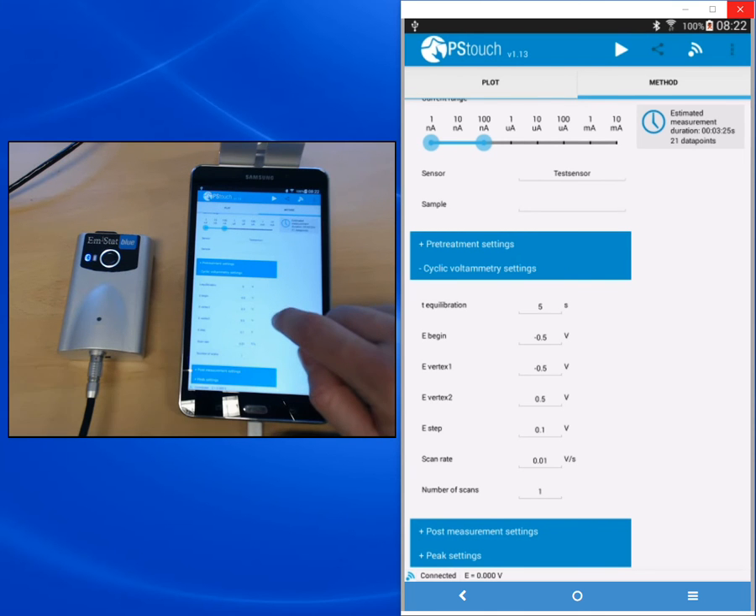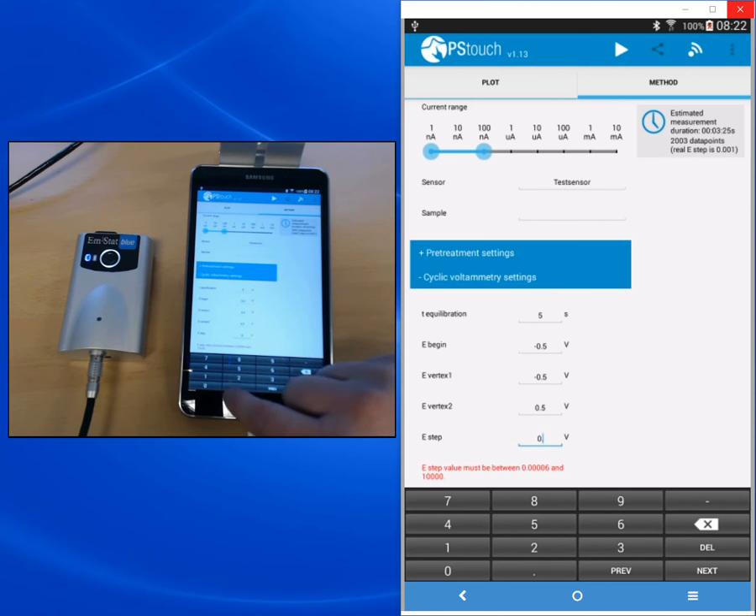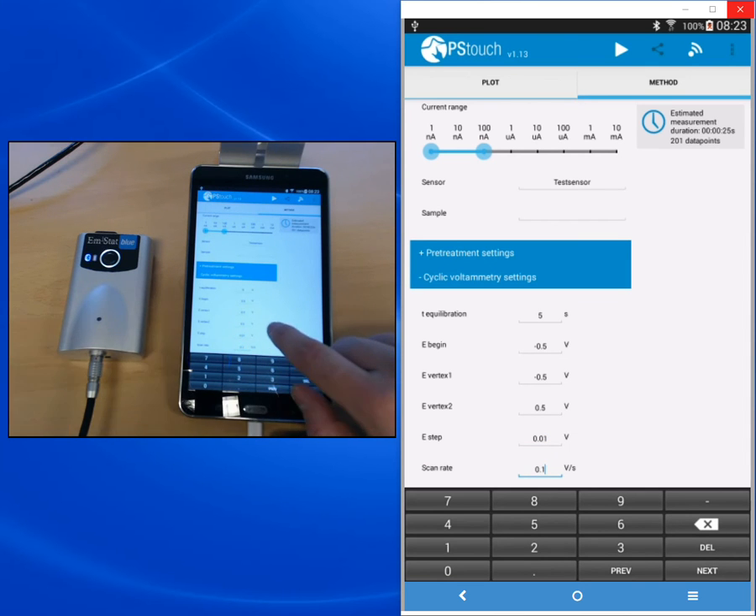We want to measure between minus 0.5 volts and plus 0.5 volts. So we set E begin to minus 0.5 volts, and the vertex potentials are the limits of the CV, so we set them to minus 0.5 and 0.5. The step potential is the distance between two measured points, so we set it lower than 100 millivolts. The app gives immediate feedback if you put an invalid value in a field. As soon as you enter a valid value, for example 10 millivolts (0.01 volts), the negative feedback disappears.